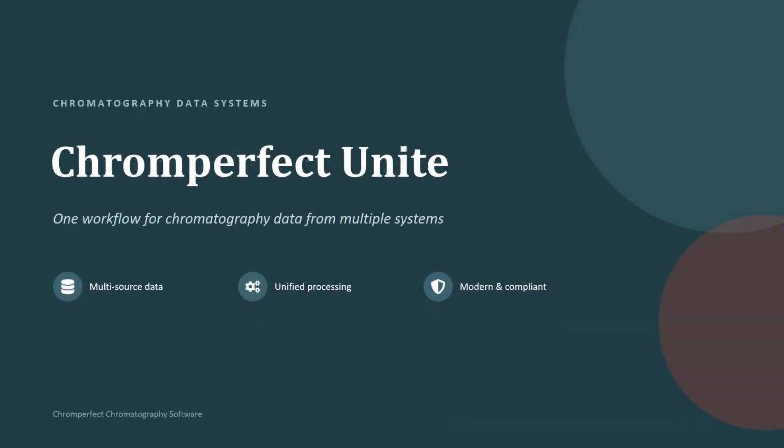Today we're taking a closer look at Chromperfect Unite, a tool built for one very specific, very common laboratory problem. What do you do when your chromatography data doesn't all come from the same system? By the end of this video, you'll understand exactly what Unite does, what it doesn't do, and whether it's the right fit for your laboratory.